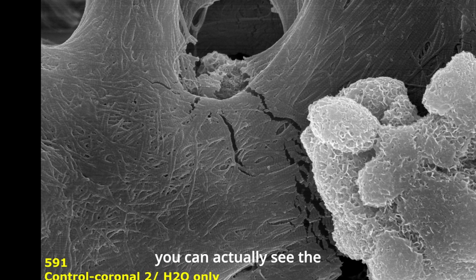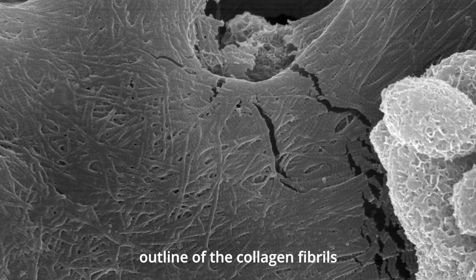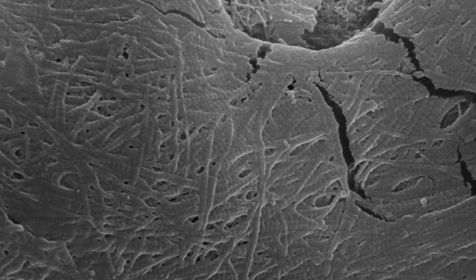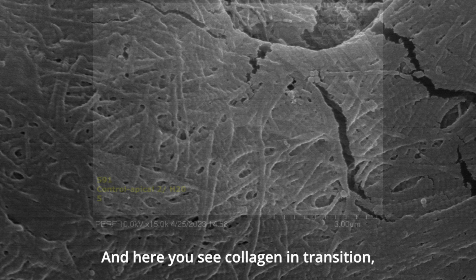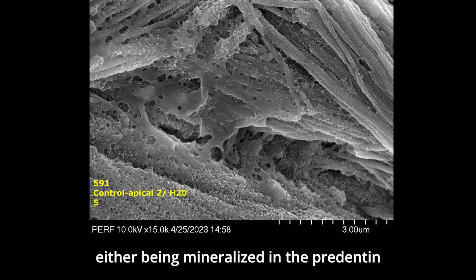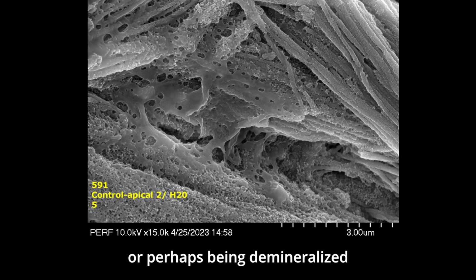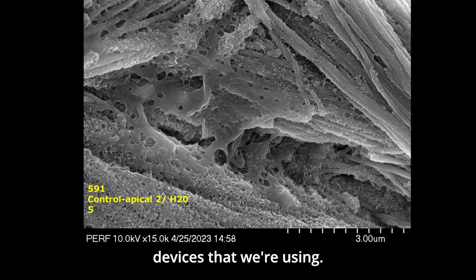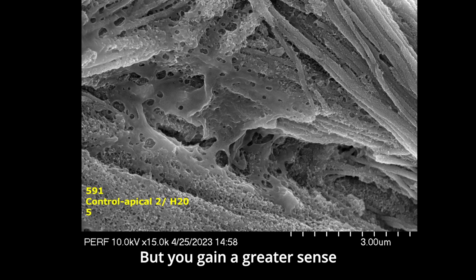And on the mineralization front, you can actually see the outline of the collagen fibrils with their classic 67 nanometer divisions. And here you see collagen in transition, either being mineralized in the predentin or perhaps being demineralized through the irrigation devices that we're using.